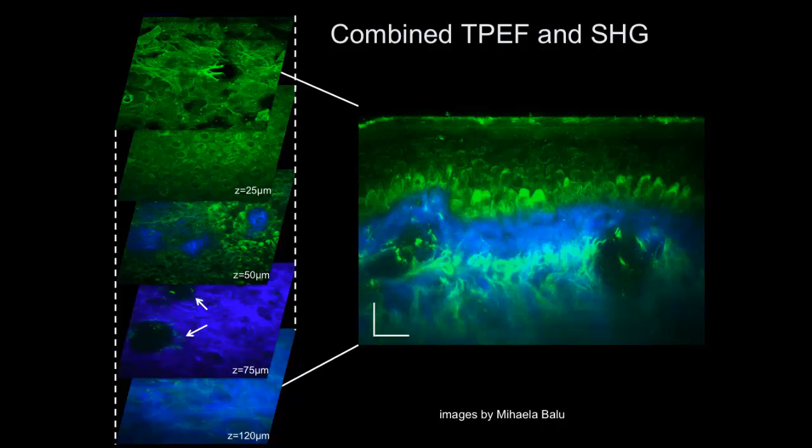This is very significant. You could actually do diagnostics with this without scooping out the tissue. And this is really where multiphoton microscopy can probably make a difference. Okay? It really has the potential of an optical histology. Basically looking at the tissue, coming to a diagnostic without scooping out the tissue. Okay? This is the main prime potential of nonlinear optics in the clinic. It hasn't been fully realized. The potential is there. There are just a lot of other cultural barriers.